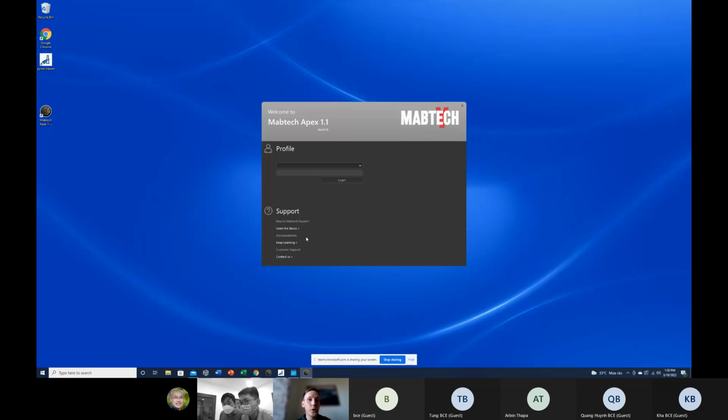So that can be good to be aware of when moving around the instruments in the future: as long as you have a connection between the reader and the computer, you will bypass the license activation process. But if you want to install it on a computer where you're not connecting to a reader, then you would have to activate licenses, and then you need our help with that process. Okay. But here now, we are just going to log in and then check that everything is fine.